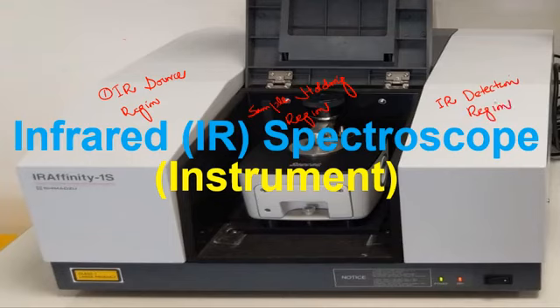So dear student, the infrared source region is a region in which the infrared source is placed. The infrared source in the infrared spectroscope generates infrared radiation, which travels in the forward direction toward the sample holder. These infrared radiations have a wavelength in the range of 750 nanometer to 400,000 nanometer.